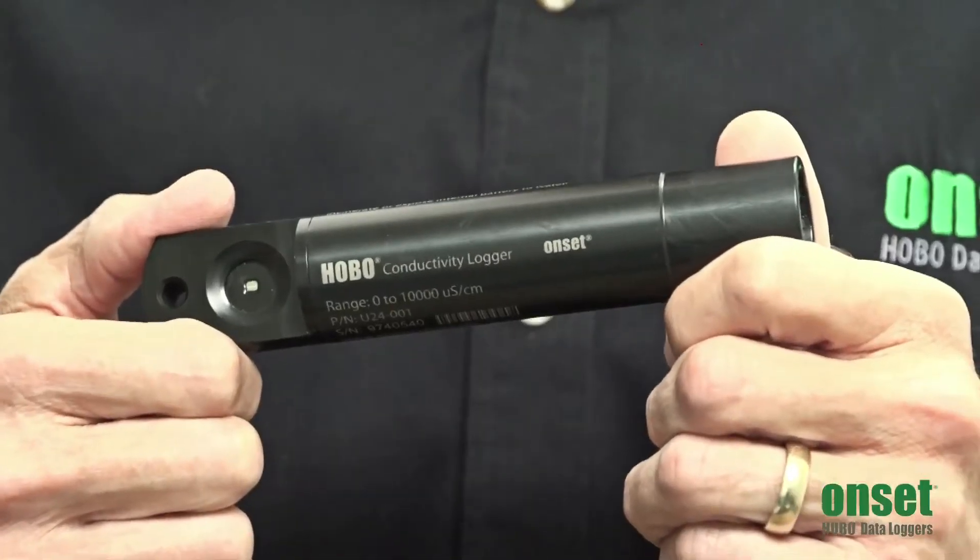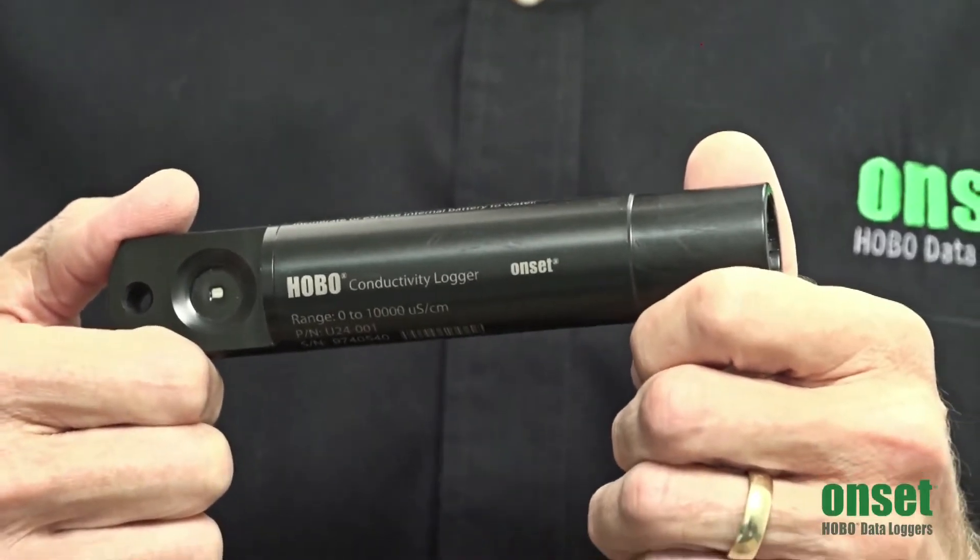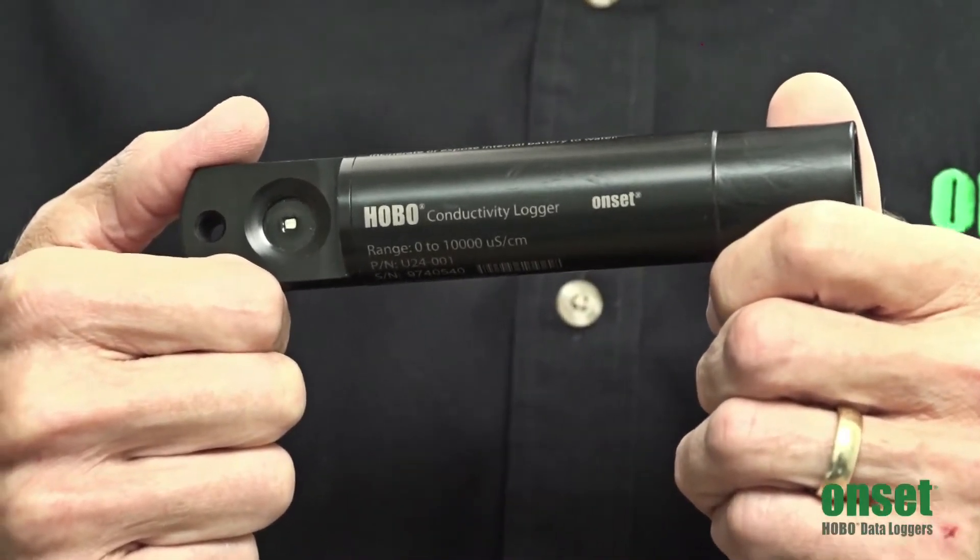Hello, my name is Paul Gannett. I'm going to give you a quick overview of our HOBO conductivity and salinity loggers. These come in two versions: one that measures up to 10,000 microsiemens per centimeter for freshwater, and one that measures up to 55,000 microsiemens per centimeter for saltwater.